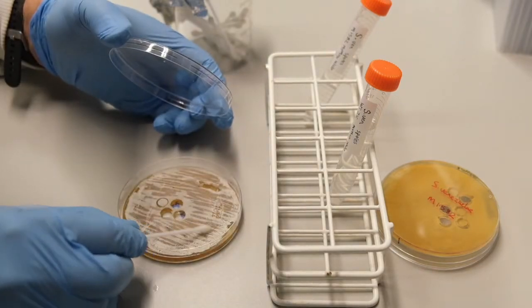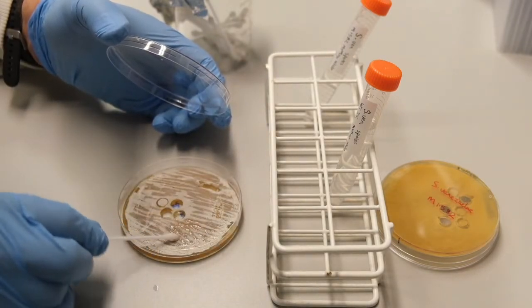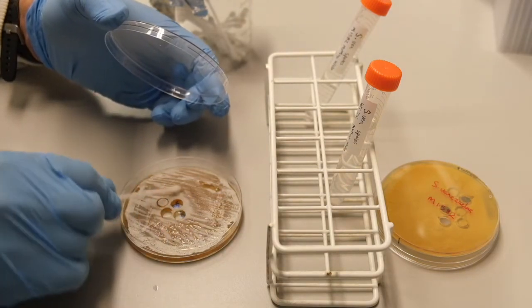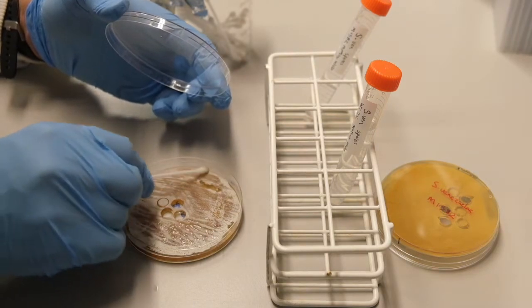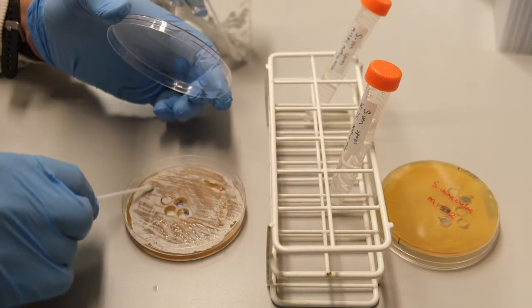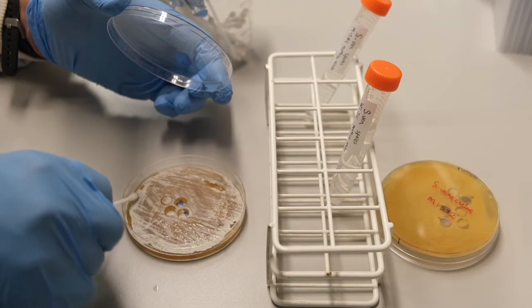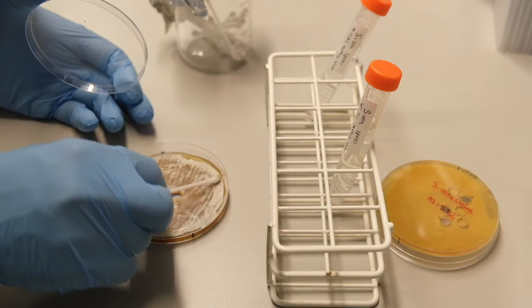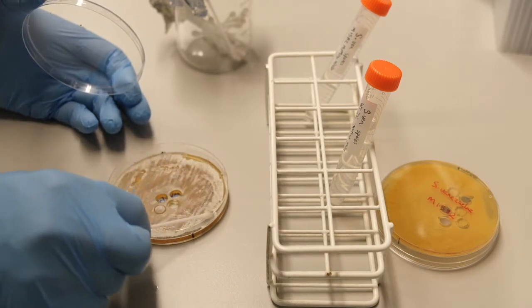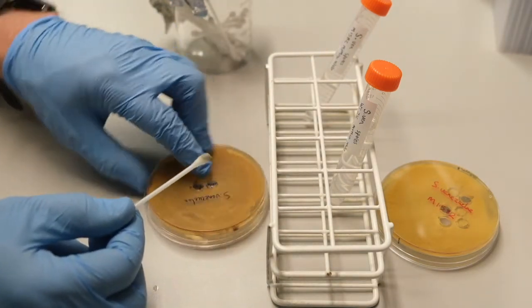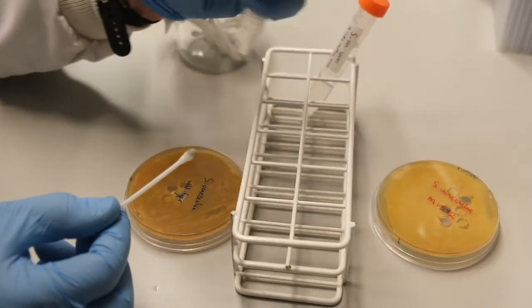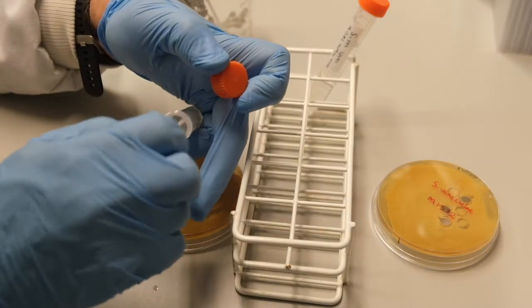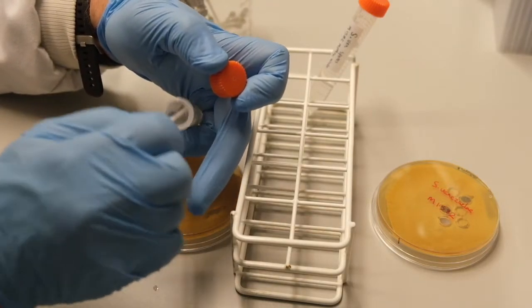The wet cotton bud can be used again to collect any remaining spores from the surface of the plate. The remaining collected spores can be added to our spore stock by dipping once more into the same solution of 20% glycerol.